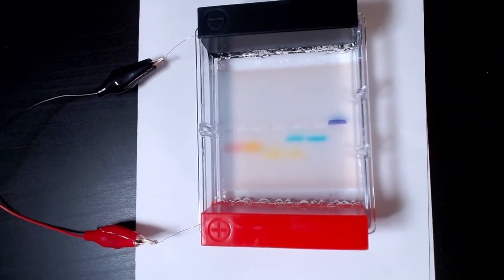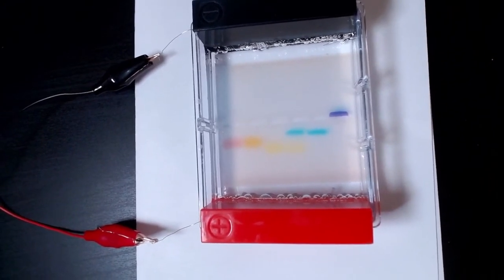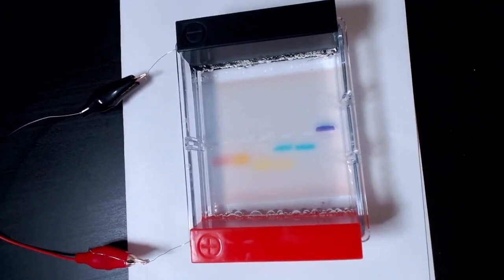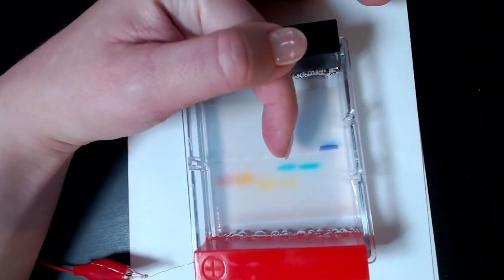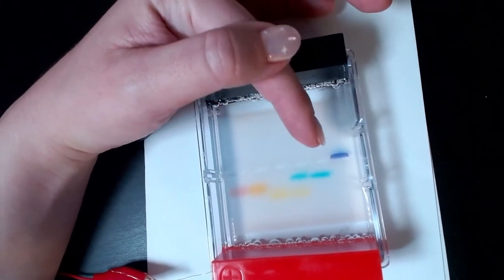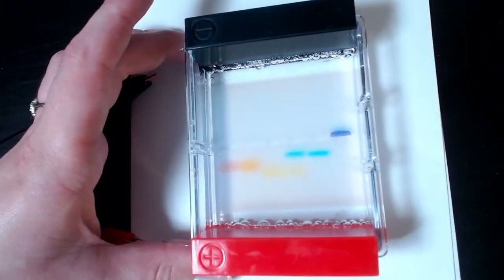Okay, so I've added a piece of white paper under our gel here, and you can see our red, orange, yellow, green, blue, and purple dyes. And you can see that some of them have moved towards the negative electrode, and some of them have moved towards the positive electrode. You can hopefully see that this green band in the middle here, well, actually, it wasn't a green dye. You can see that it was composed of a blue and a yellow dye. And then our purple looks a little different from the others. So we're going to walk through the results of our gel in a picture back in our PowerPoint.